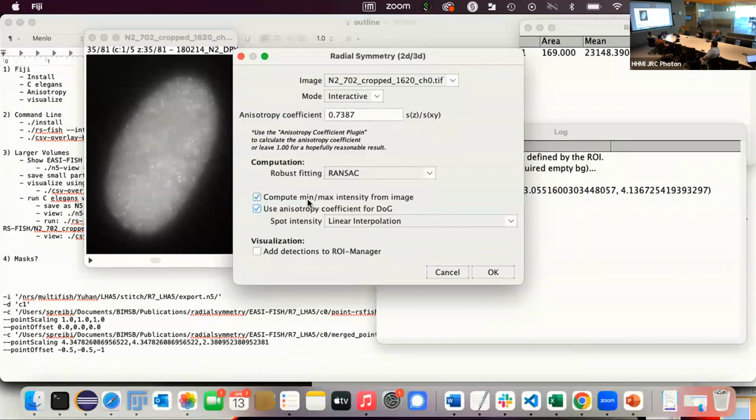Then, if you run it over 1000 images and say it's always between 0 and 1000, it will apply that. Also, when you run it distributed on a cluster with Spark, it's the same thing, because the image is so big that you can't first iterate all pixels to find out what the min/max is. In that case, the Spark version will ask you to provide this when you run. Otherwise it can only get it from a little block that it's currently processing, and that might be dark. That's why this min/max is kind of important.